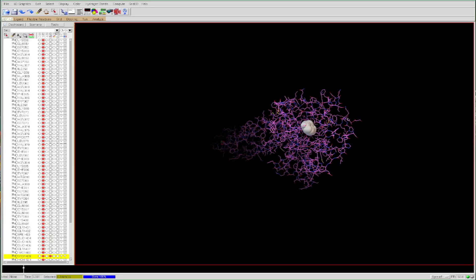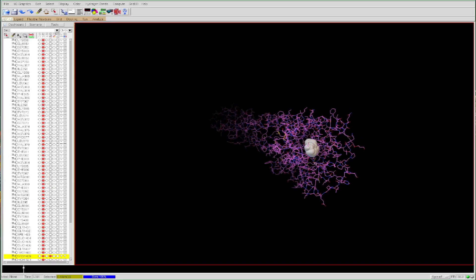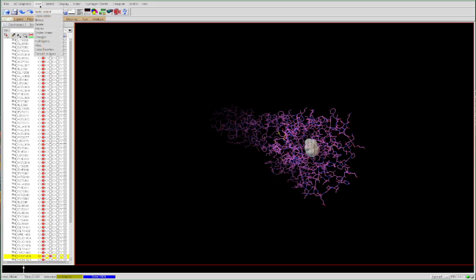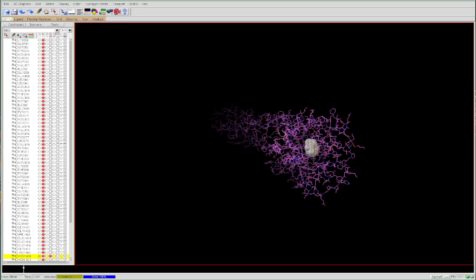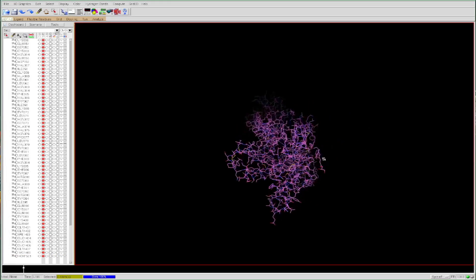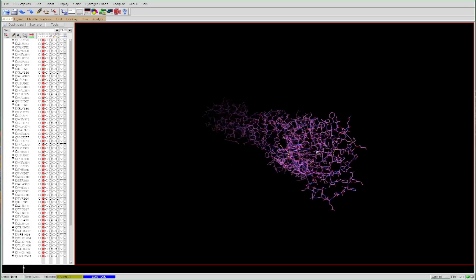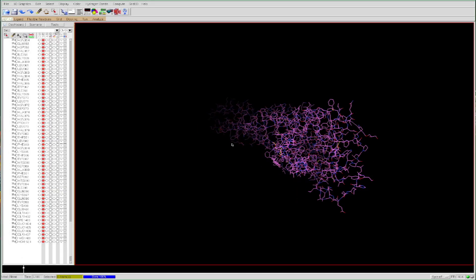The next thing we'll want to do is remove the serotonin molecule from the receptor, so that we can use AutoDock Vina to determine where in the receptor site serotonin best fits. To do this, we go to the residue on the left, select it by clicking the circle, then go to Edit > Delete > Delete Selected Atoms, press Continue, and now we have the 5-HT2A receptor with no bound molecule.